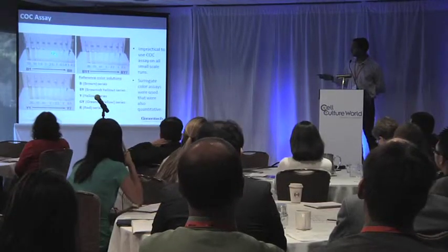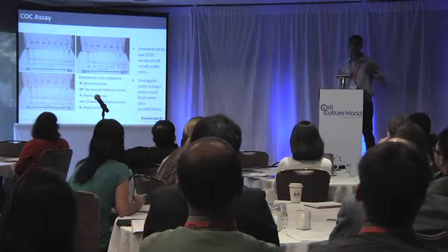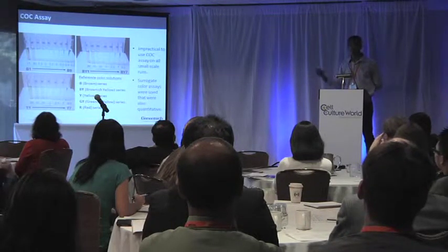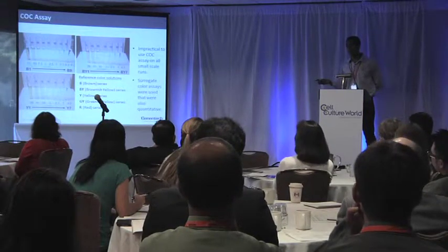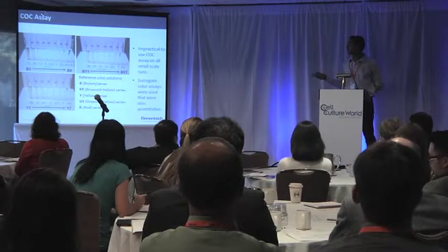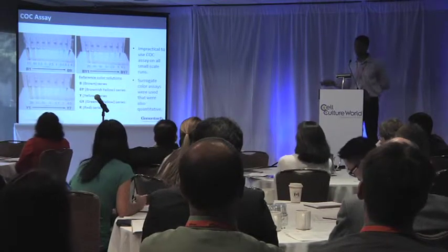The other disadvantage with using this COC assay is, as you might say, this color of my shirt is blue, but who knows if it's navy blue or royal blue. And that's always a case of these samples also. There's a lot of subjectivity in the rating of the samples, even by the COC method, and it's not quantitative enough to detect minor variations that may occur between two reference samples. So we also wanted our surrogate assays to be quantitative.